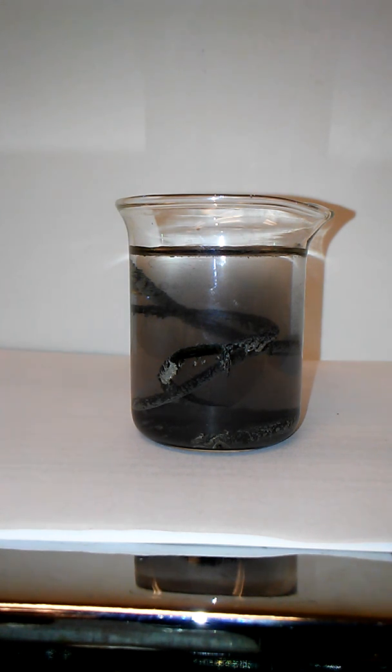And to be honest, it's probably a combination of it's getting low in the bottle, and so then there's probably some undissolved silver nitrate or silver compounds sitting at the bottom, and so when I poured it out, some of those came with it. The rest of it is just the fact that it does darken when exposed to light, and it's been sitting out for just 2 periods, and it's probably enough that it has discolored too much, which is a bit of a shame.